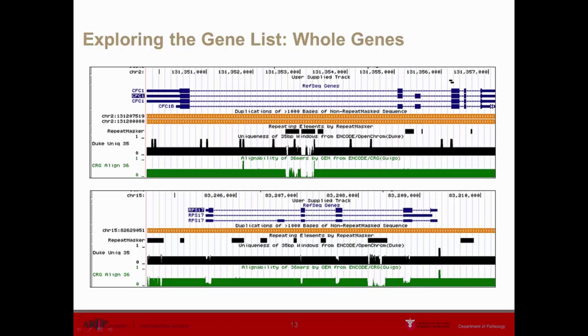In these genes, because of segmental duplications and their similarity elsewhere in the genome, they were not able to place unique probes. There were a total of 36 genes out of those 4,600 that, when we examined the list, had no coverage. An attempt was made, but no coverage.